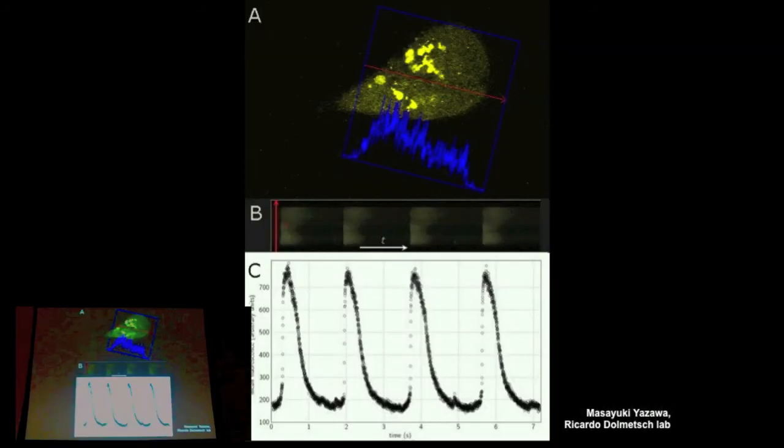Just a quick couple examples of the kinds of things that you can do with the confocal. Here, these are line scans from cardiac myocytes derived from iPSCs. A single line can be scanned very, very rapidly, microseconds per pixel, so here 100 pixels in the millisecond range. Then you can take a whole bunch of those, line them up, and see the calcium transients. This is labeled with Fluo-4, and you can see the calcium transients in a spontaneously beating cardiac myocyte.